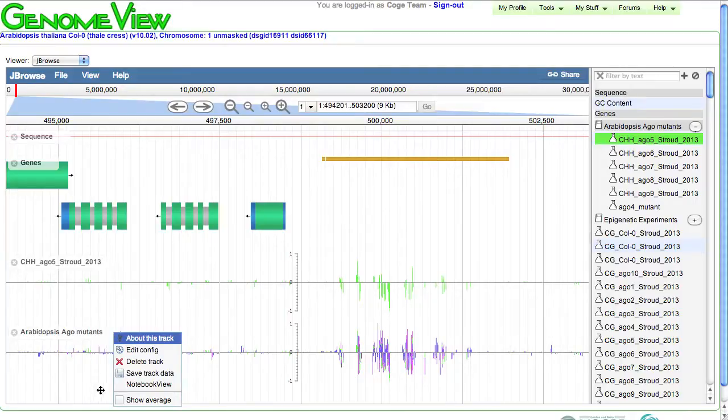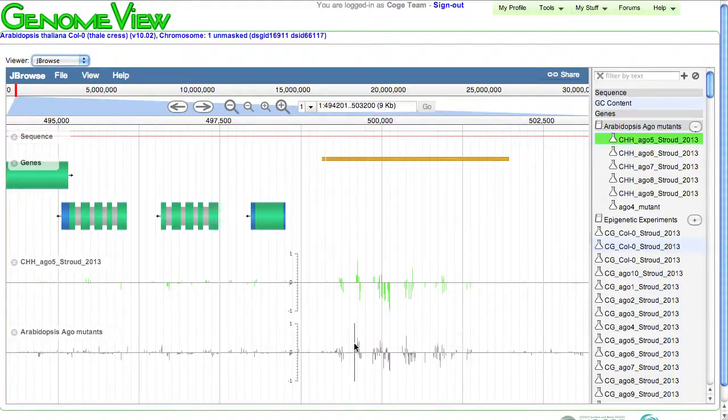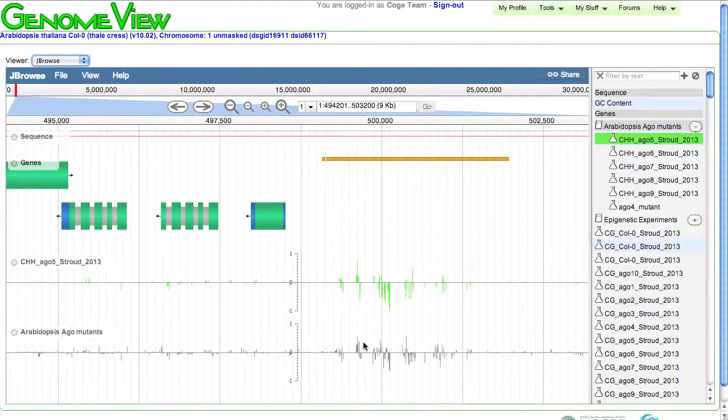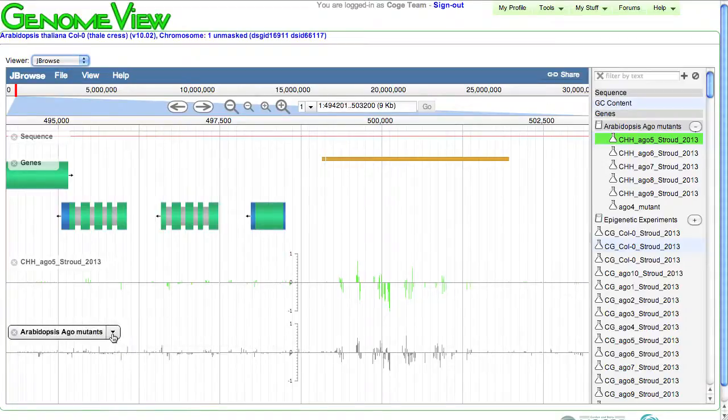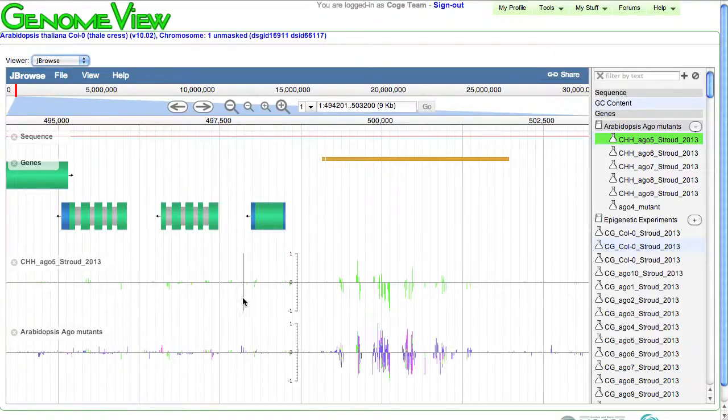For example, if I select this button to show average, what it will do is take all of those experimental values and average them together so I can take a look at the aggregate behavior of all of these genes at once. This is turning out to be a very nice framework.